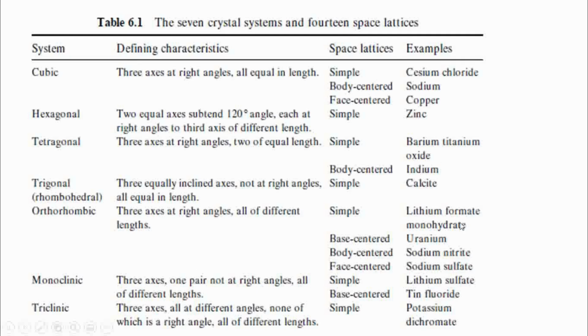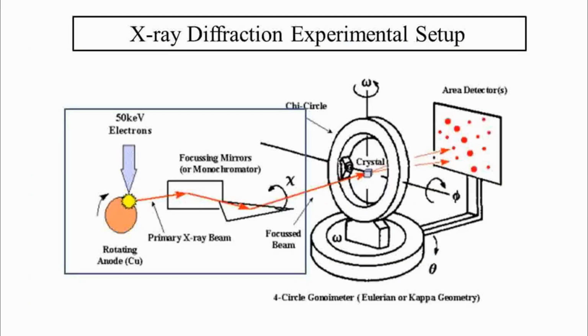So this is some of the examples. These examples will help you. Today you can go back home, take out the crystal structures of all these, and see how they are different from one another, right? Once you understand this basic crystal designing and the orientation, you have to be a little bit imaginative in this part: in your mind you have to create a 3D space and see how your protein is oriented in it. So this small information will give you a better understanding.